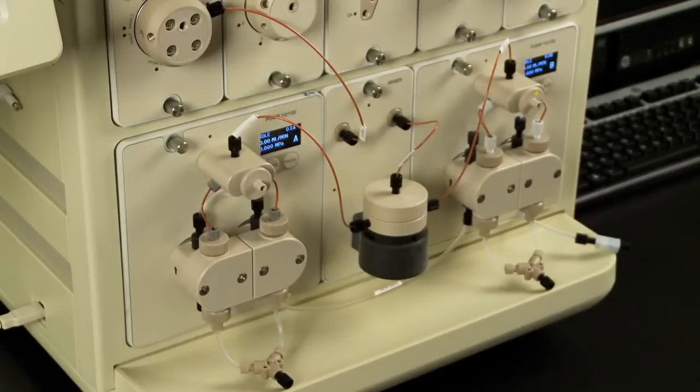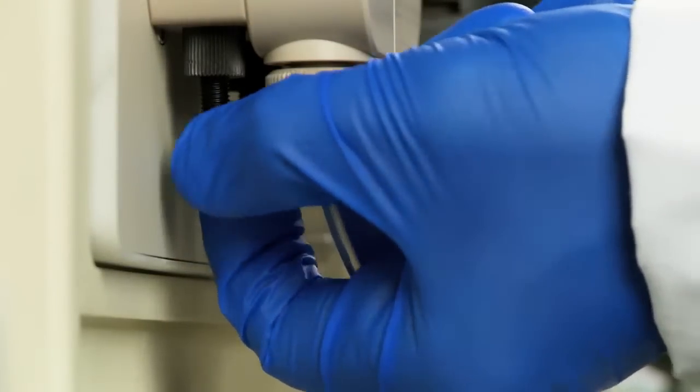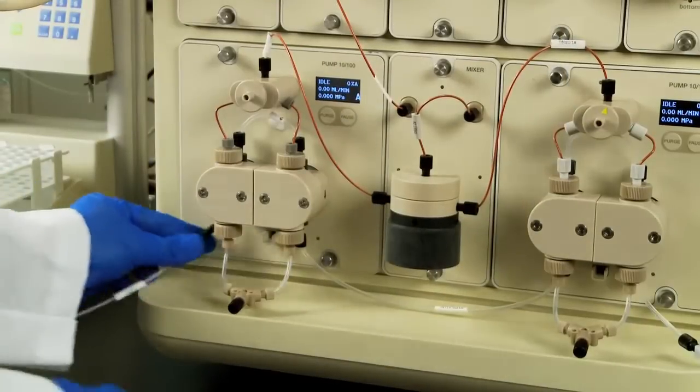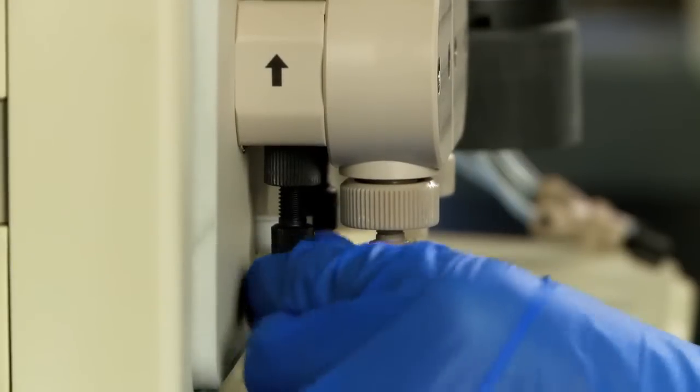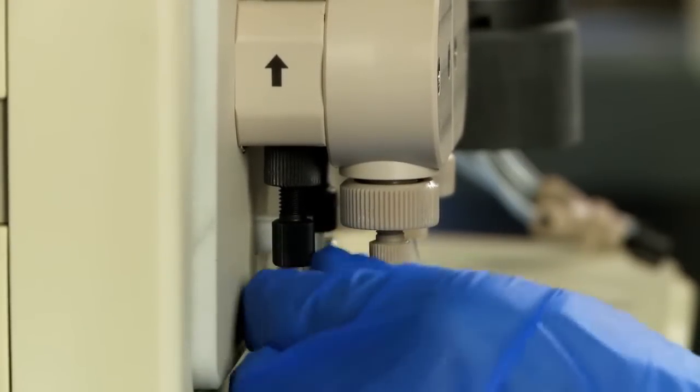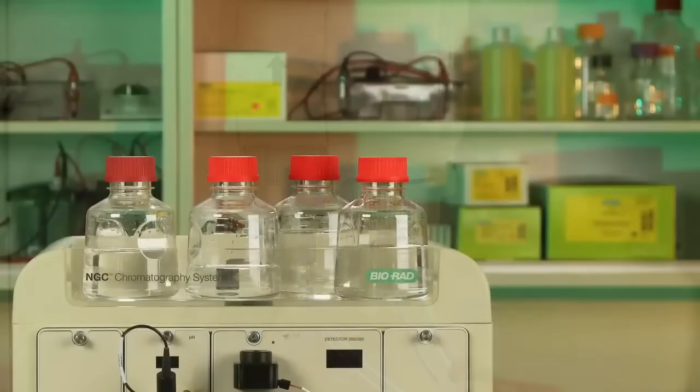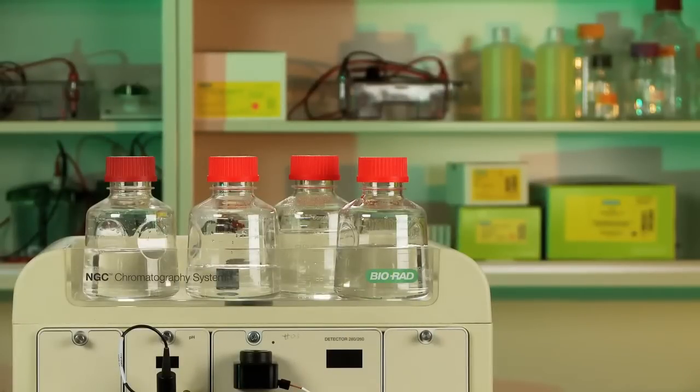First, you will be preparing the pump head washing system. Start by connecting the inlet line, labeled inlet, to the pump wash inlet port of System Pump A, which is the left-most bottom port. Set up a wash reservoir bottle and place to the side or top of the NGC.